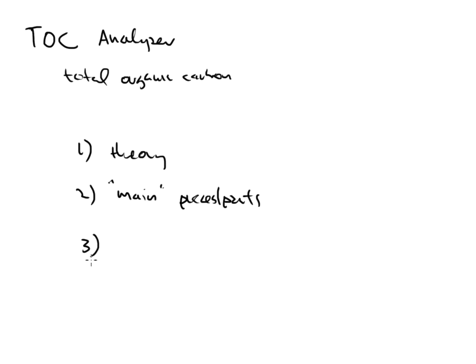If one of these goes out, then you really can't do any analysis or anything. And then number three are what I'm going to call the support features. These are pieces and parts of the equipment as well that allow it to do its job a little bit better, a little bit faster, a little bit quicker, and a little bit more reliable. So that's how this lecture is going to be broken down.